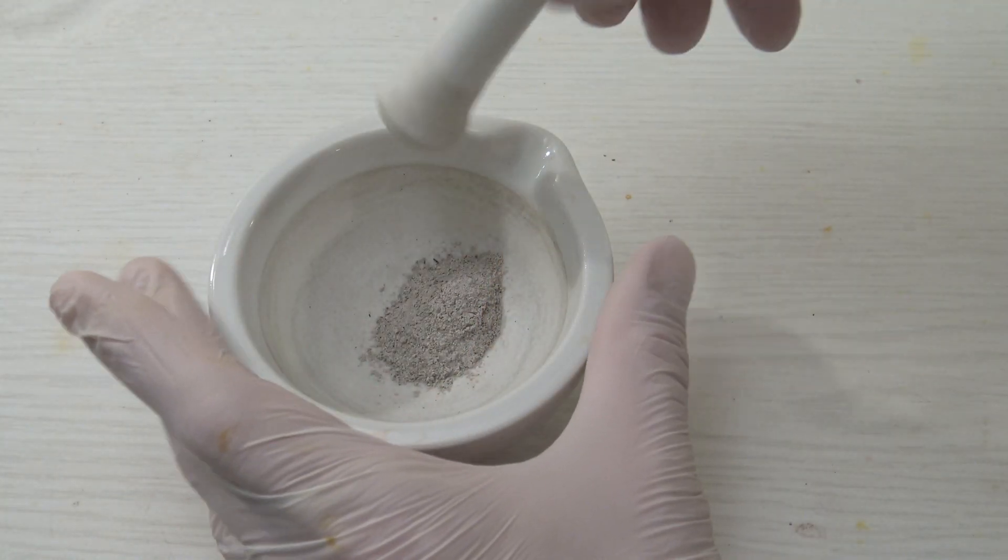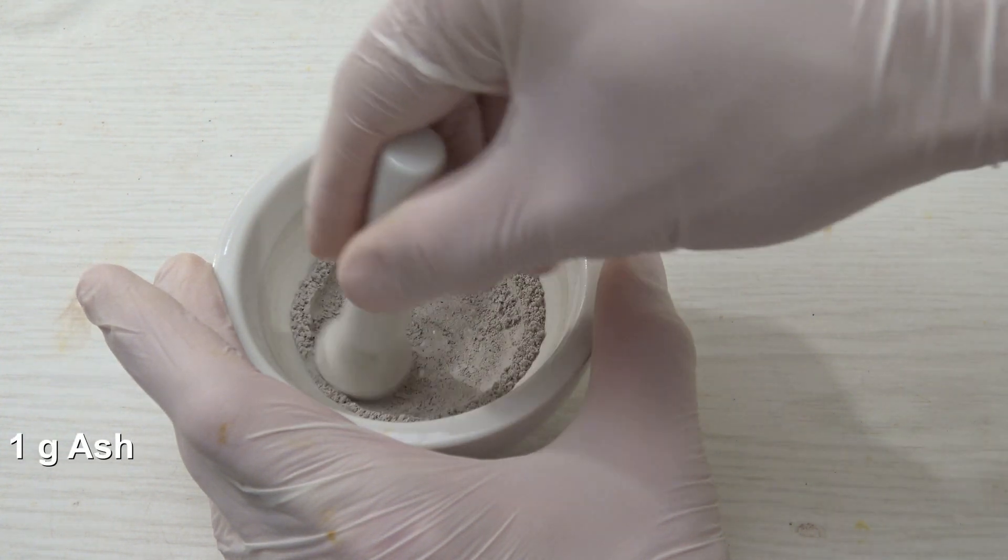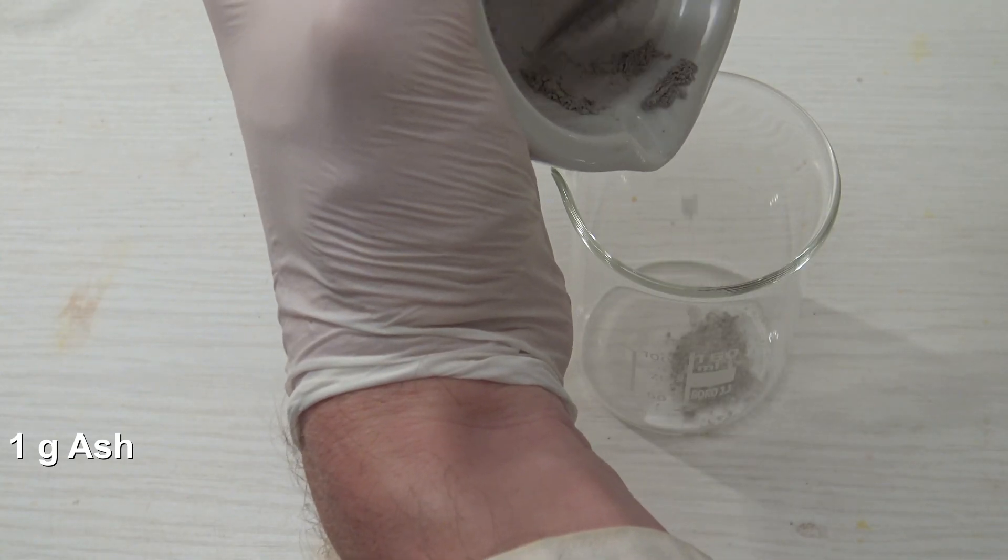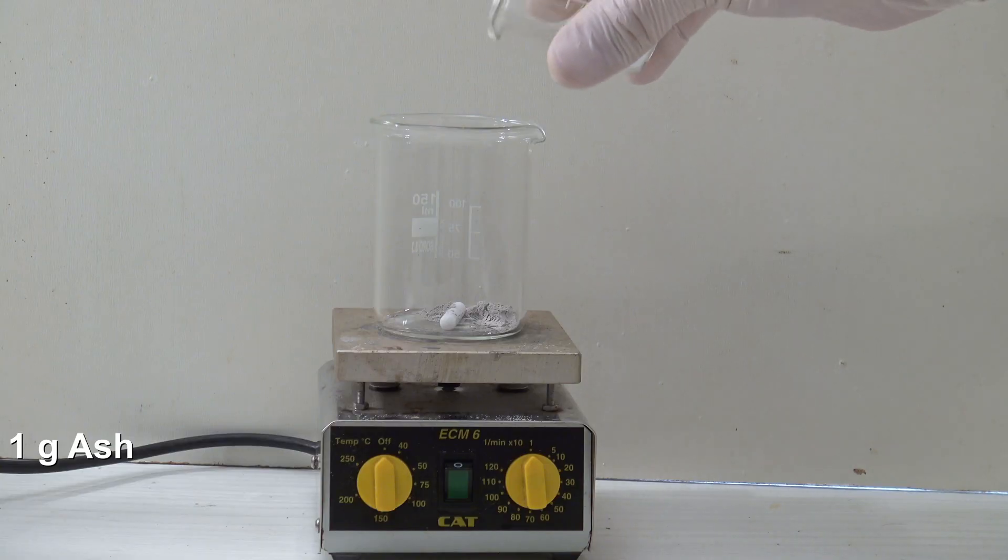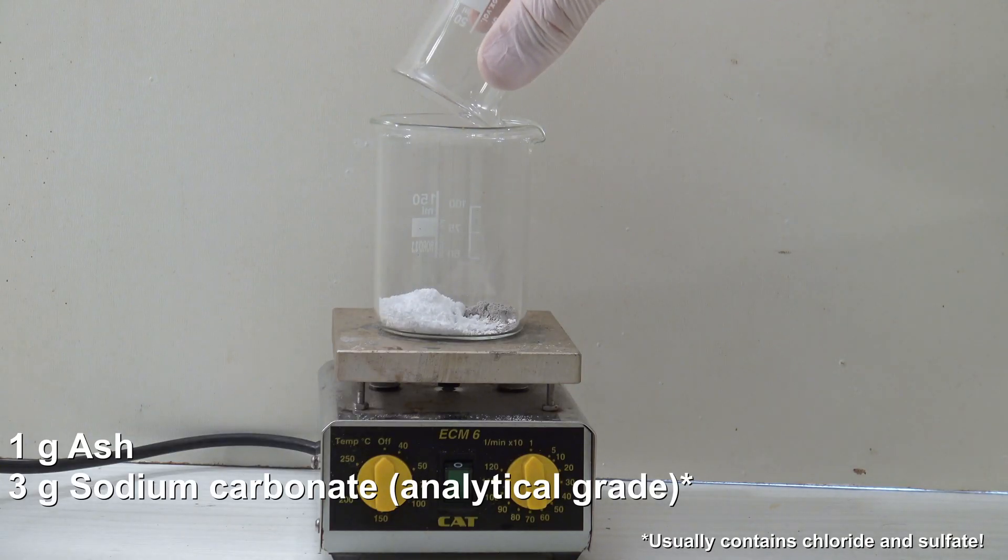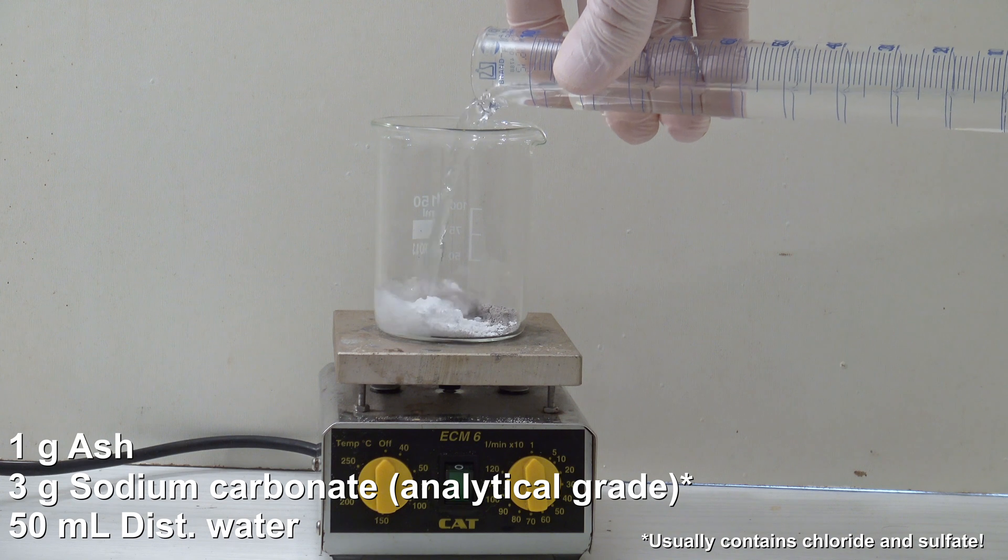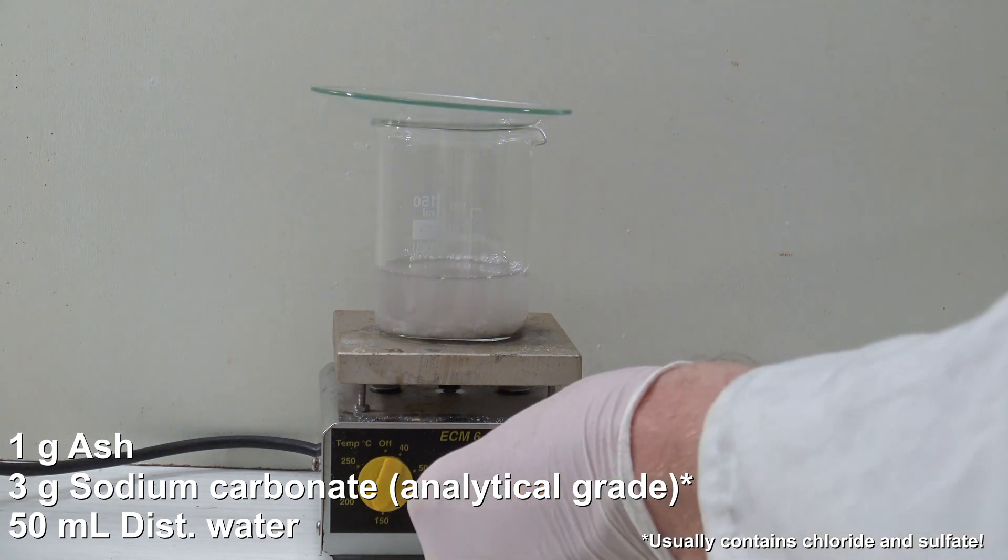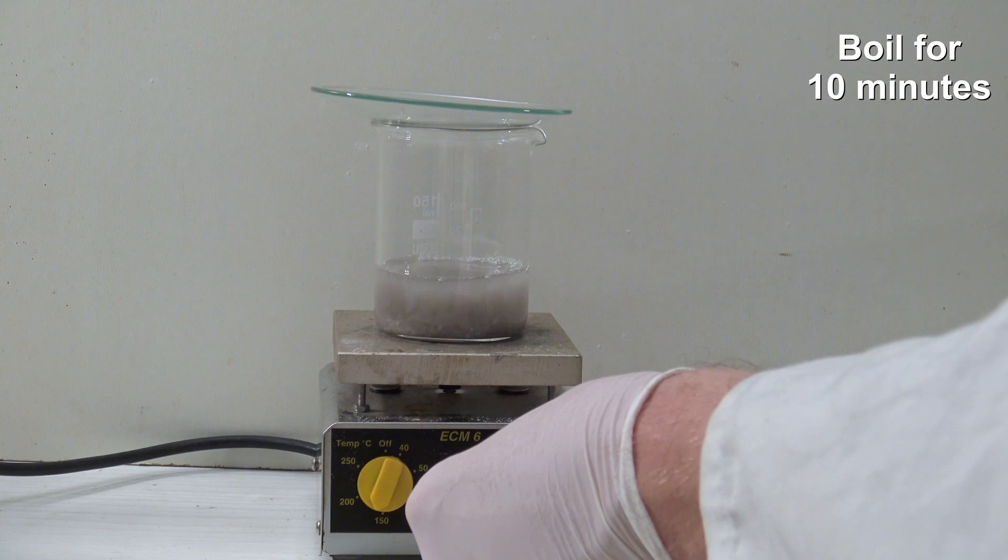To test for other ions, one gram of the ash was crushed into a fine powder and added to a beaker. To this, 3 grams of analytical grade sodium carbonate and 50 milliliters of distilled water were added. Then the mixture was stirred and heated to a boil for 10 minutes.